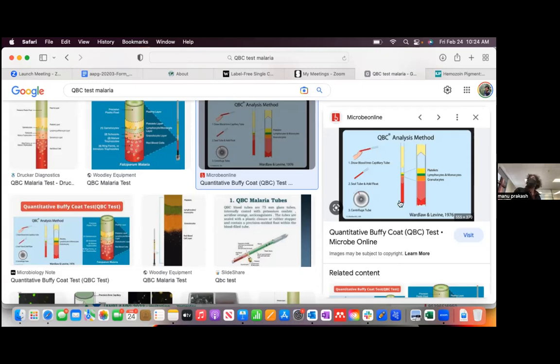So there's a capillary and just a piece of plastic in it. But that piece of plastic has exactly the same density of the region where you want to stretch it. And so now the cells are actually in this thin zone between that piece of plastic and this capillary. So you have effectively stretched it.